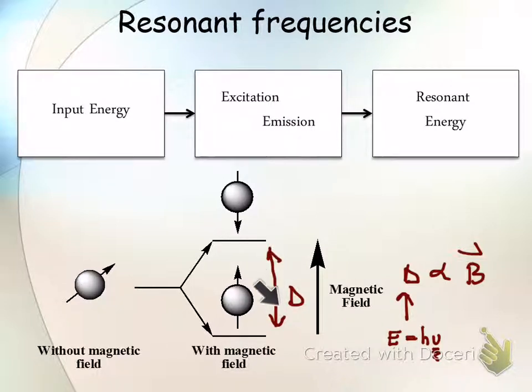It uses a smaller magnetic field because that makes the energy difference here smaller, so then the frequency is going to be smaller, okay? The bigger the magnetic field, right, the better the resolution you have. Because the bigger the magnetic field, the bigger the spacing between the energy states, it's easier to resolve things that are close together.